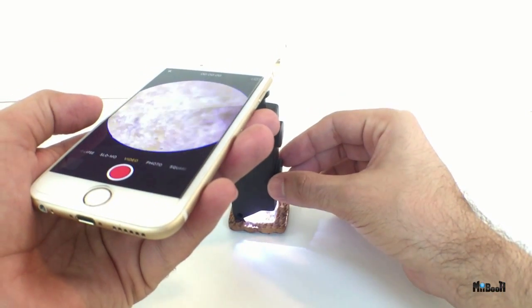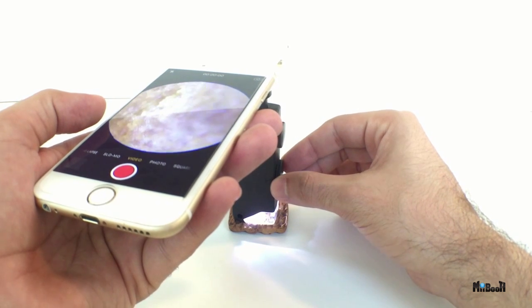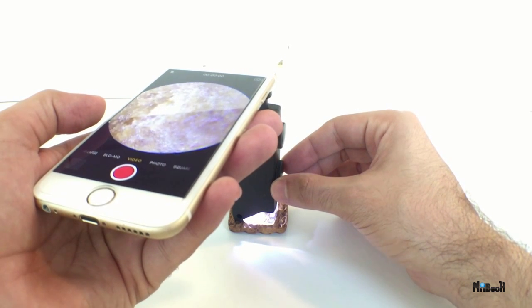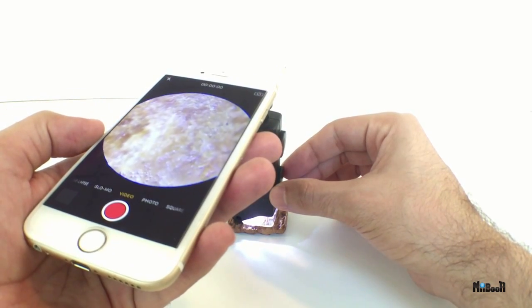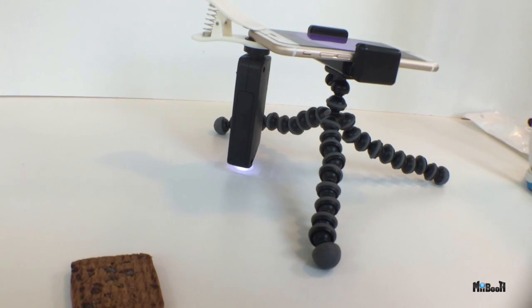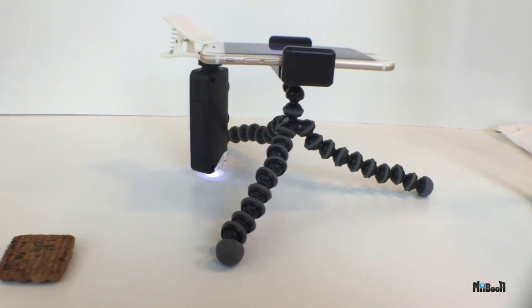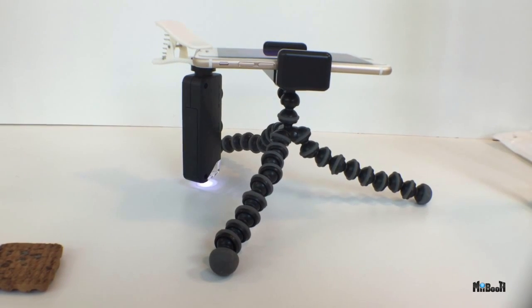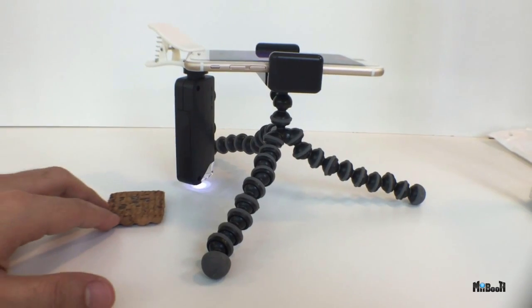Now, holding the mobile phone with the lens on it and then trying to focus can get quite tricky, and you might not get a very stable and clear image. Since the focal point of the lens is so tiny, it really needs some steady hands to get a nice shot. Considering all of this, I came up with my own makeshift microscope stand. I grabbed a Gorilla tripod with a phone adapter I had lying around and adjusted it in such a way that the lens is just about a millimeter or two above the surface.